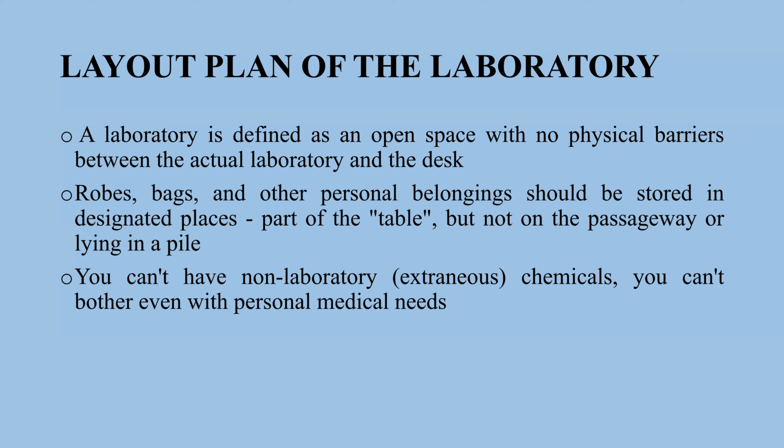These are some basic demands for a start. In my experience, I reserved several rooms. Two rooms have water supply and canalization.